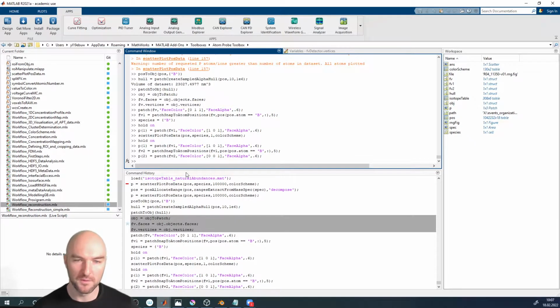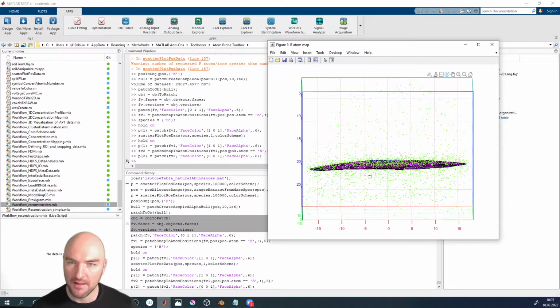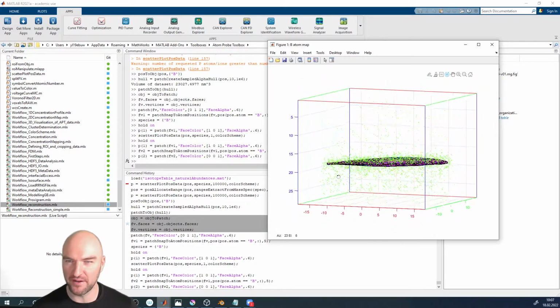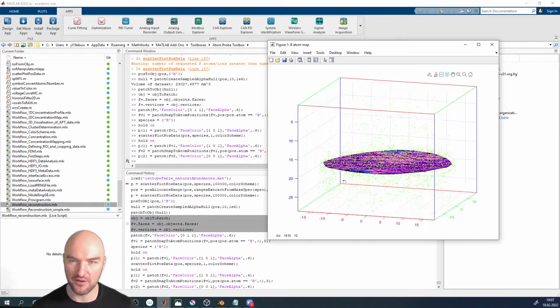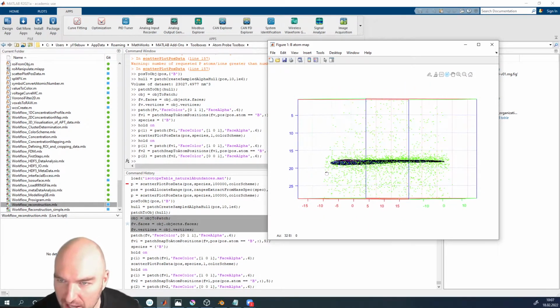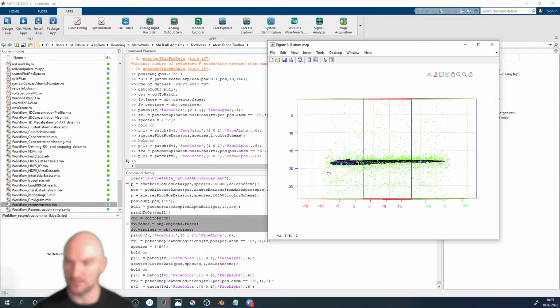This is now blue. And you can see we're pretty much converged. There isn't very much of a difference anymore between the first and the second iteration. So it sits on our grain boundary pretty solidly, and you can calculate what the difference is between the first and the second iteration, but it wouldn't be much.